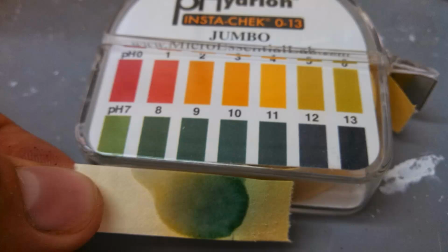So your EDTA solution, you're going to transfer from that beaker to a 500 milliliter volumetric flask, dilute it to the mark, and then transfer it to another container, because the next thing you're going to do is make your primary standard solution in the same volumetric flask. So you'll wash it out, weigh out the appropriate amount of calcium carbonate into the flask, and then follow the directions to make that solution. All right. You'll also want to check the pH of that one to make sure that it's around the correct pH.